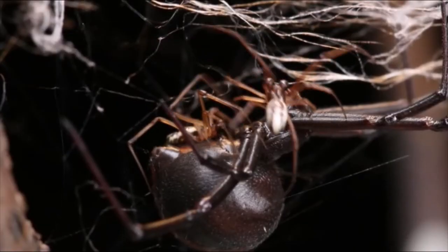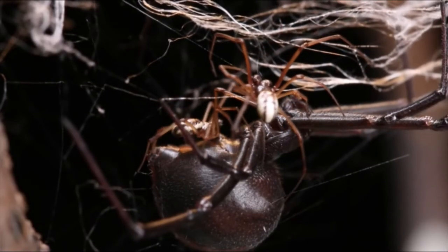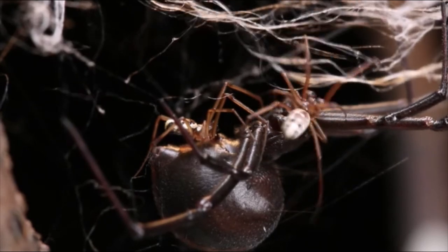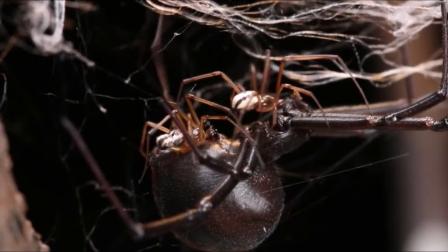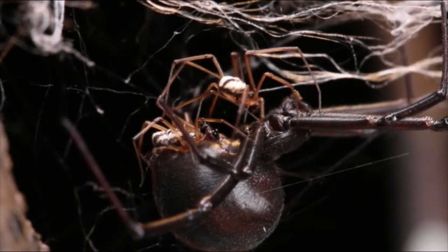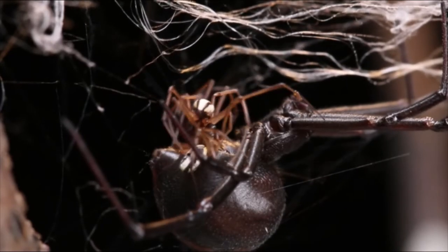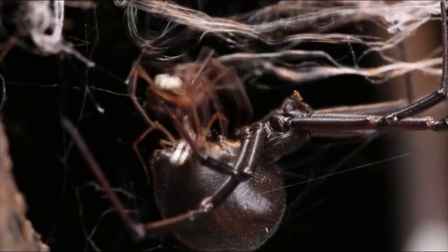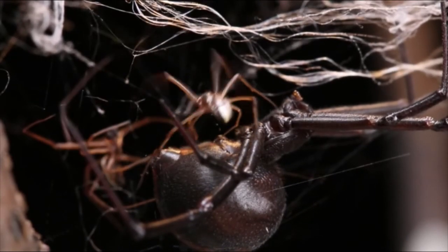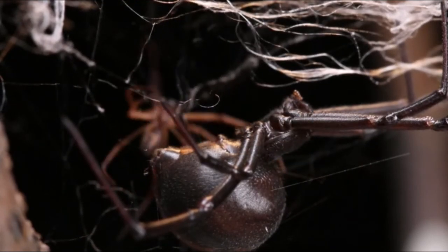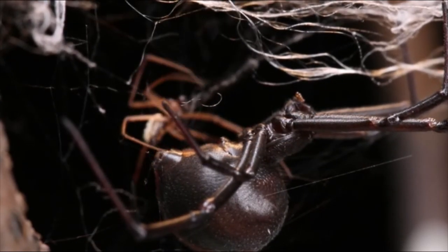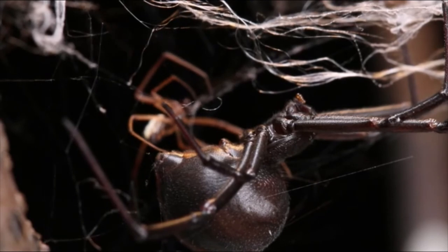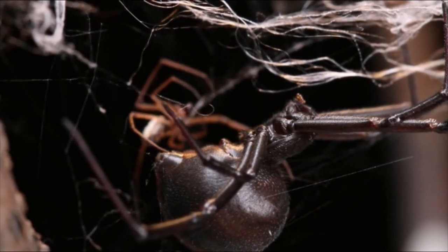Let's jump ahead in some of these experiments with two males competing for a female. What you can see is that they will actually engage in what we call fatal fighting. One male here is biting a second male who had begun to mate, and that second male dies as a result. This kind of thing is not seen that often in nature, so this is really an interesting opportunity to ask about high stakes mating.